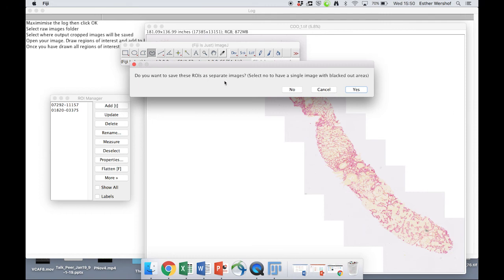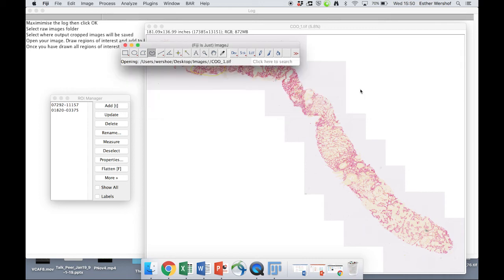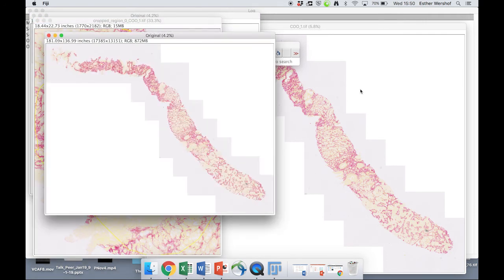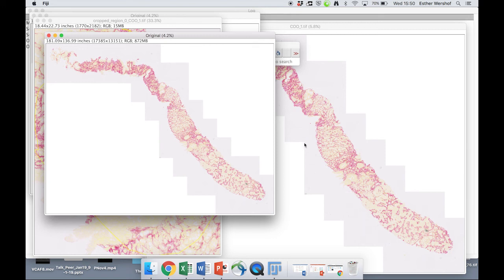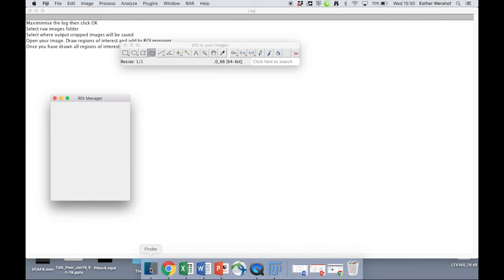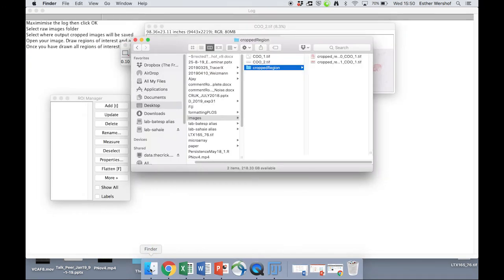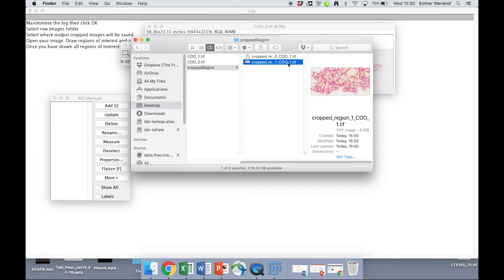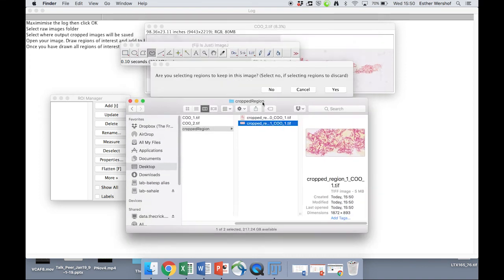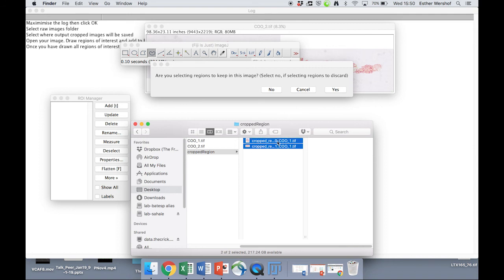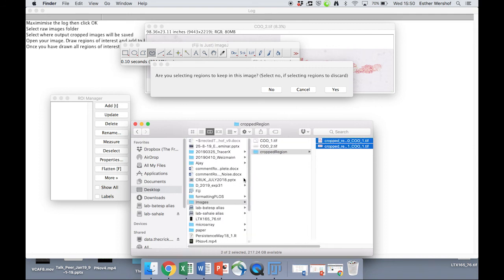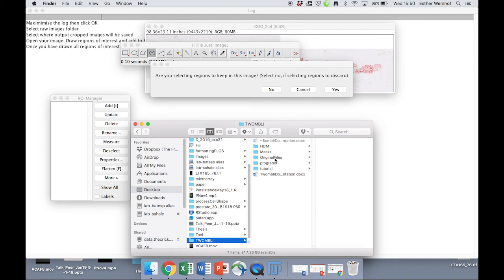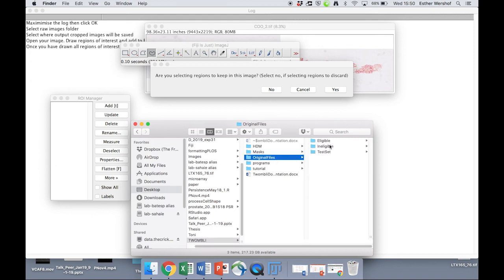We're then given the option of whether or not we want to save these regions of interest as separate files or as one single file. So let's say we do want to save them as separate files for now. And that's all just saving. And what you'll end up with is those cropped regions being saved in this new directory. And once we've gone through all of our images and cropped them down, we can then copy these images into Twombly.